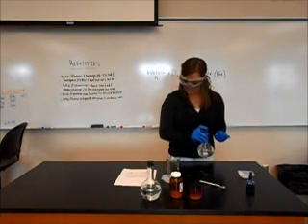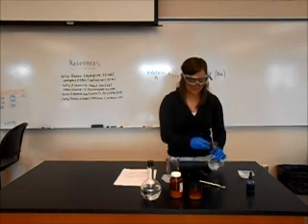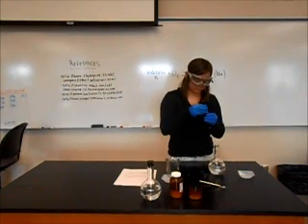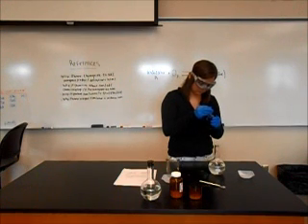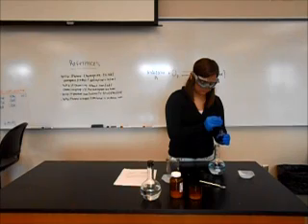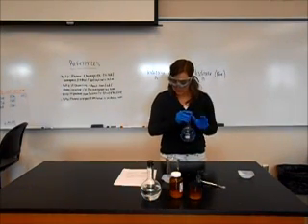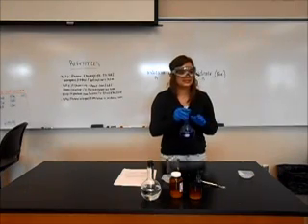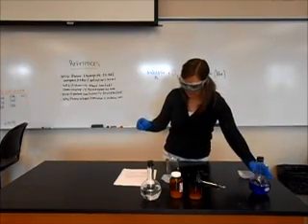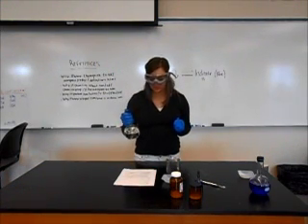And then dissolve that. And then you're going to add 6 to 8 drops of the methylene blue indicator, and I just use 7 because it's in the middle. And then you shake this and let it sit until it becomes colorless. And then I already made another one to save some time that's already colorless. And then what you do is you just shake it and the blue color should reappear.